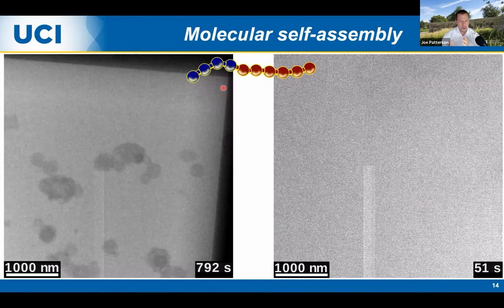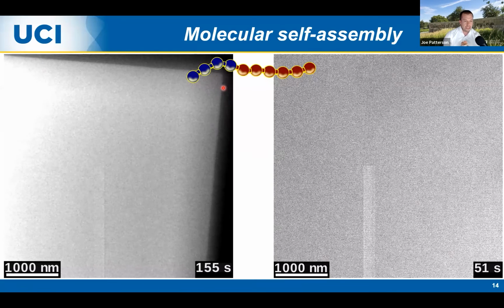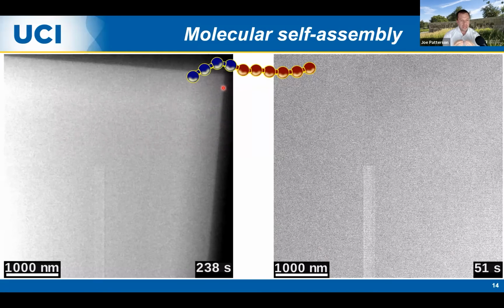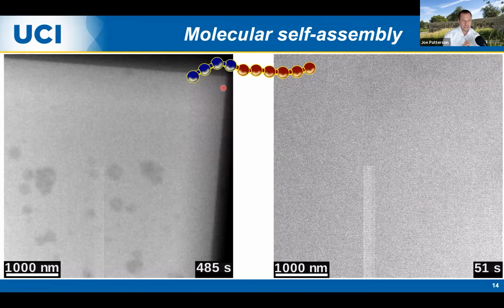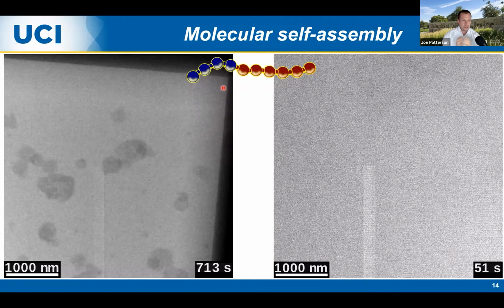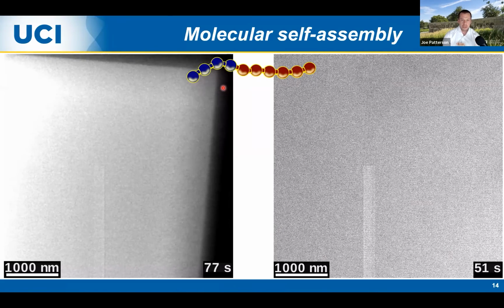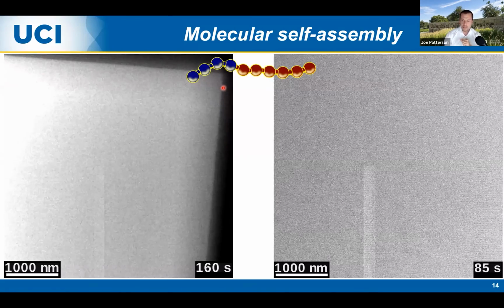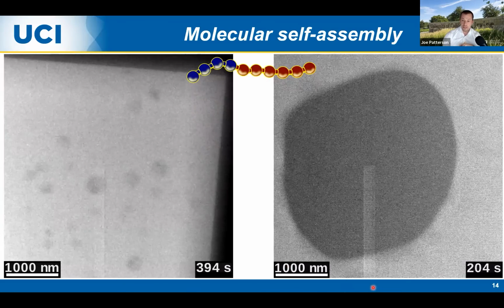And it may or may not be clear to you, but to me and Arne, when we look at this in the very early stages of this movie, the way these particles are moving around and the way they're interacting is not what we expect. There's too much motion and too many dynamics for these to be solid materials. At the end of the movie, they look a lot more solid, but in the beginning, it looks a little bit different. I'm going to show you another movie here where maybe this will be a little bit clearer.